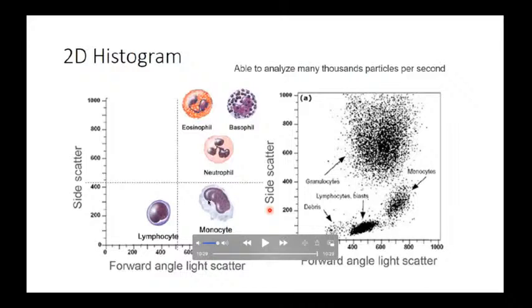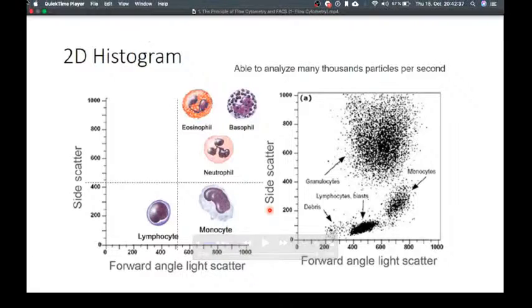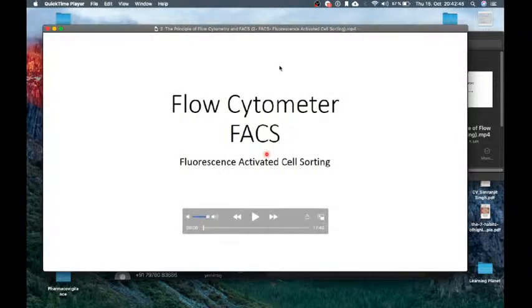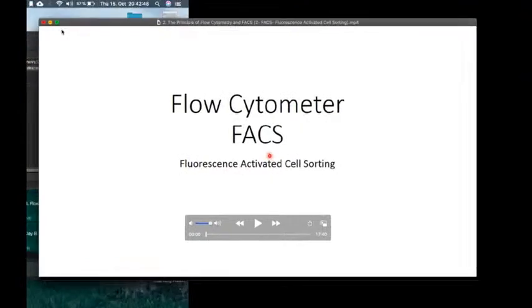So students, you understand how you differentiate between your monocytes, neutrophils, eosinophils, and basophils, having a forward scatter and side scatter, having the complex and the large cells on top, and simple cells and small cells to be here like debris, and big cells and simple cells to be on this side, complex cells and small cells to be on this side. So in this way we can differentiate between our cells. Now comes the next part, FACS analysis. So that was flow cytometry before. Now comes the next part of it.